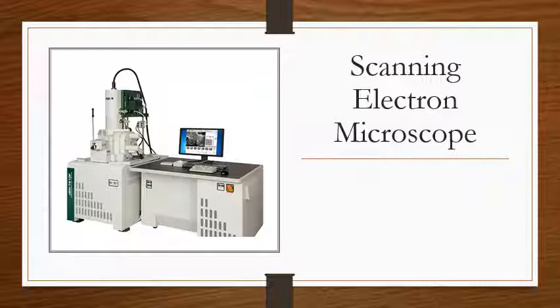Slightly less magnification than the TEM, and I have not seen resolution information for the SEM. But I would imagine it is still better than the light microscope. I've also seen conflicting data as to whether or not it can be used with living cells. Some sources say yes, some say no, so I'm not sure what the answer is. But the advantage of the scanning electron microscope is being able to see the surface of something.